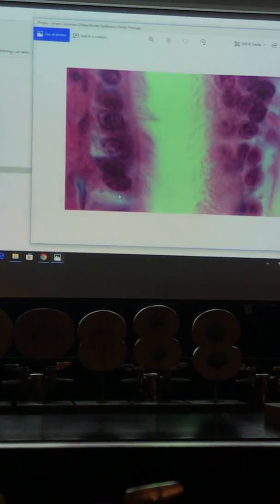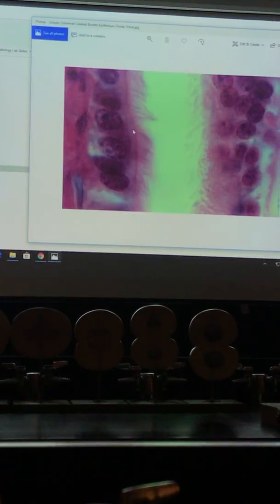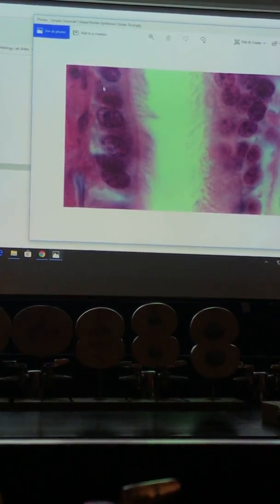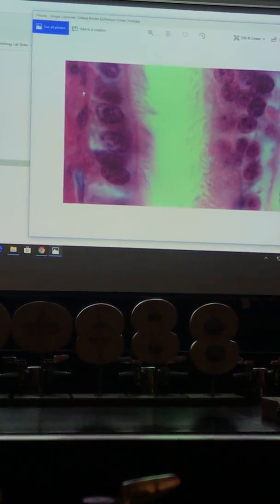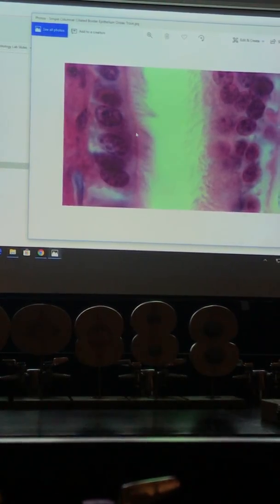This is a beautiful picture. You can't say identify the tissue. That's ridiculous. There's so much going on there. It looks stratified here. I'd go to a very specific spot based upon the angle of cut on the microtome. This is actually simple ciliated columnar epithelium. So I'd say identify structures. See the cilia? Then I'd say identify the tissue specifically. Here, it's simple ciliated columnar epithelium. So these are columnar cells. This is areolar connective tissue. This happens to be in the fallopian tube. I said I won't ask you where they are, but in your slides 4 that say fallopian tube, this is what you'll see.